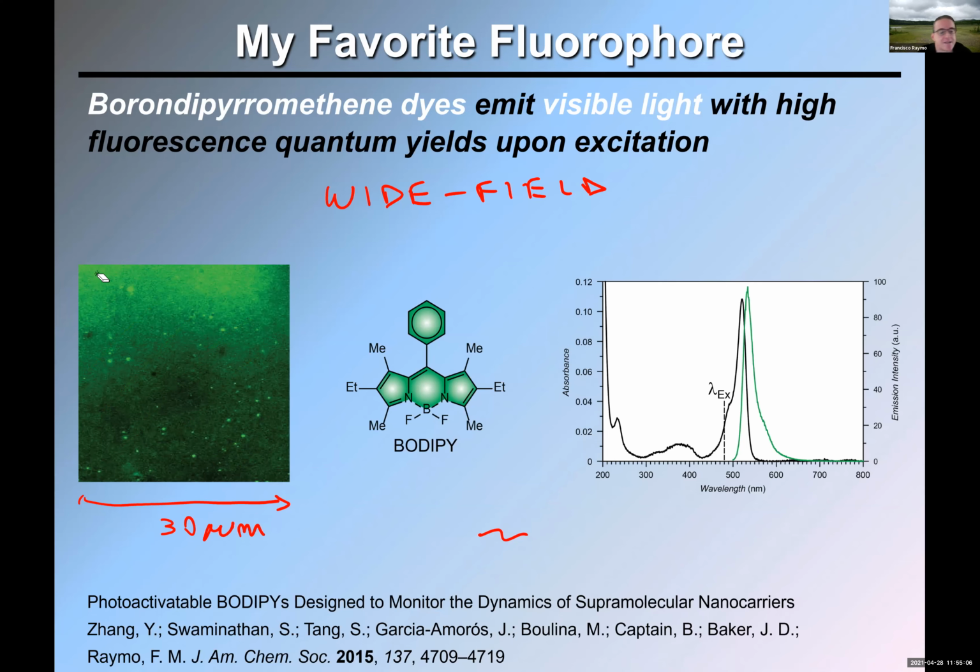All right. So instead of illuminating the entire field of view, what you can do is you can point your laser into a small spot, let's say here. And then only the molecules that are here will produce fluorescence. So you first detect fluorescence there, and then you move your spot here and collect fluorescence, and then here and collect fluorescence, and then here and collect fluorescence.